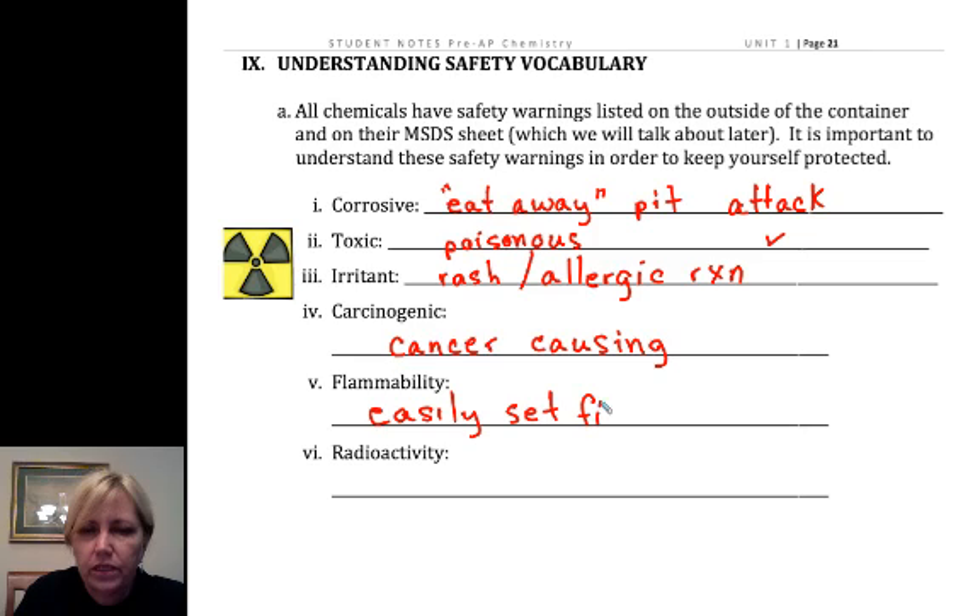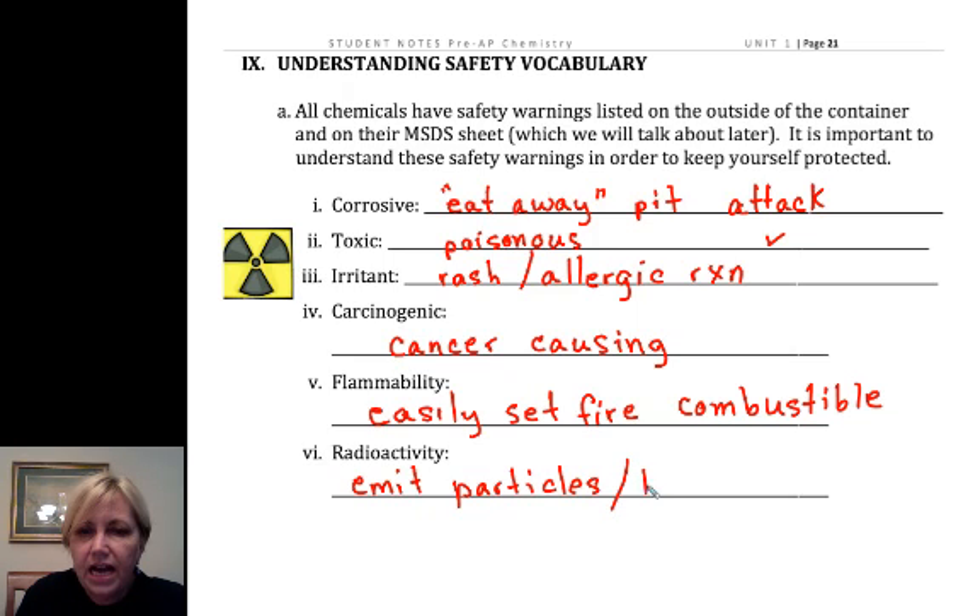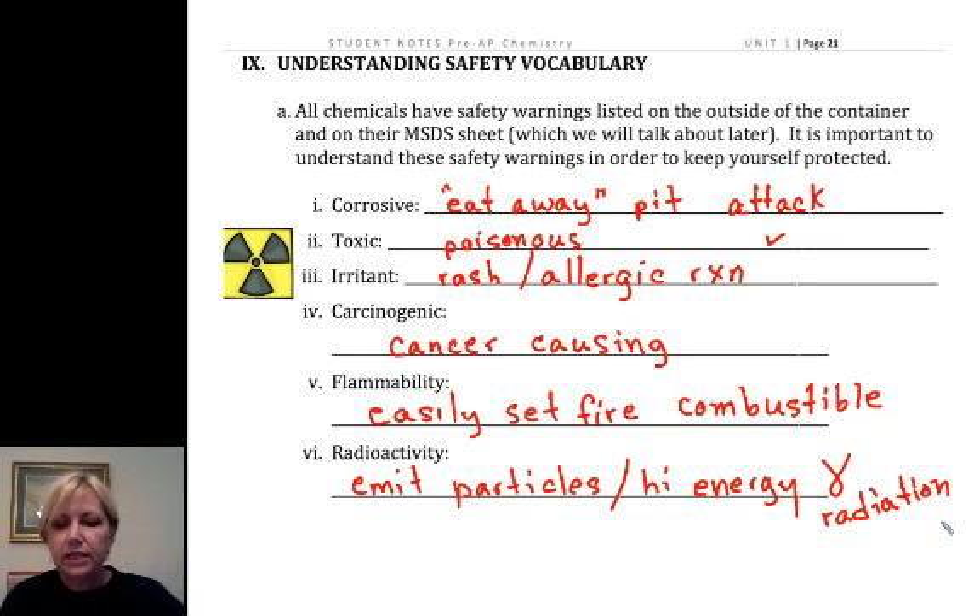In pre-AP, your chemicals are pretty straightforward, but when you get into AP we worry about flammable chemicals a bit more — some things are spontaneously combustible. Radioactive materials emit particles and often very high-energy waves called gamma radiation. We'll learn more about that in the atom unit. We're going to stop here but will continue with safety vocabulary, including the symbols and documentation we use to communicate safety issues about our chemicals.